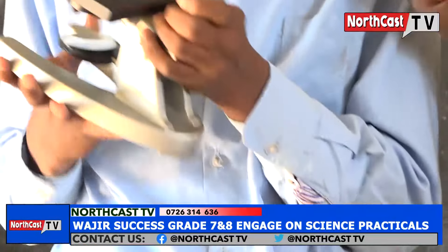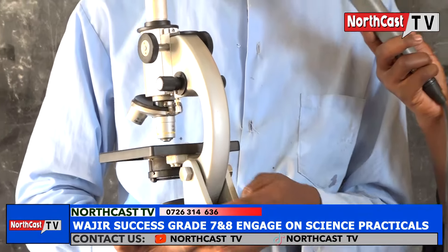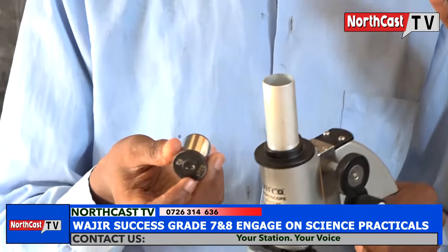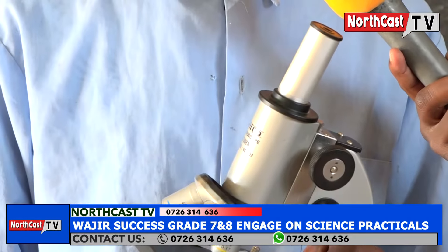The other one is the arm. The arm holds the base and the body tube. The other one is the eyepiece. This is the eyepiece. The eyepiece contains a lens which contributes to the magnification of the specimen.